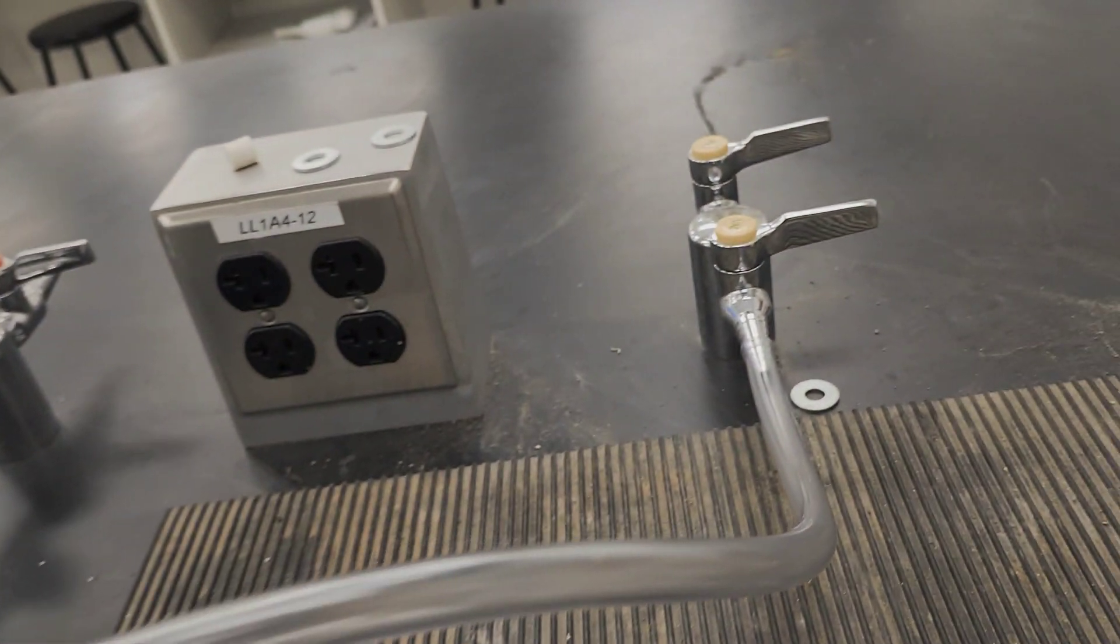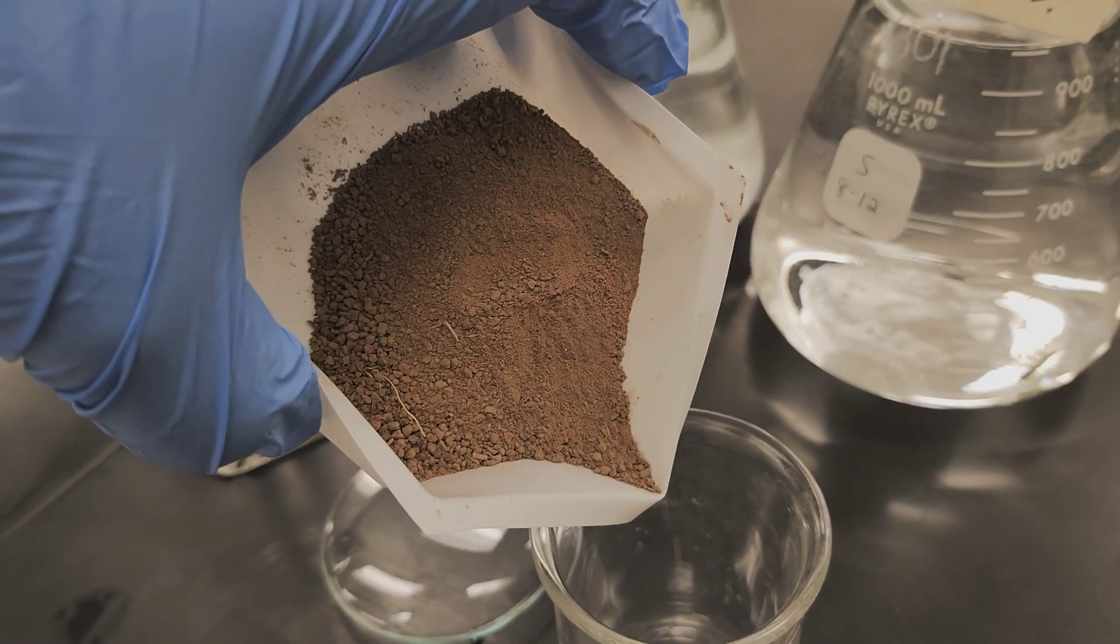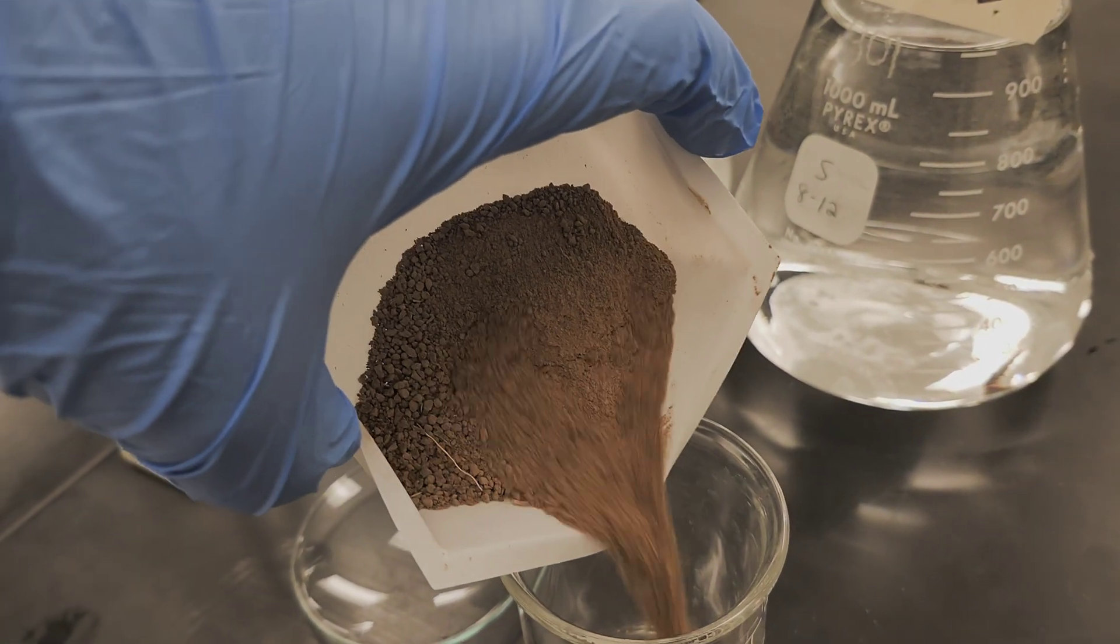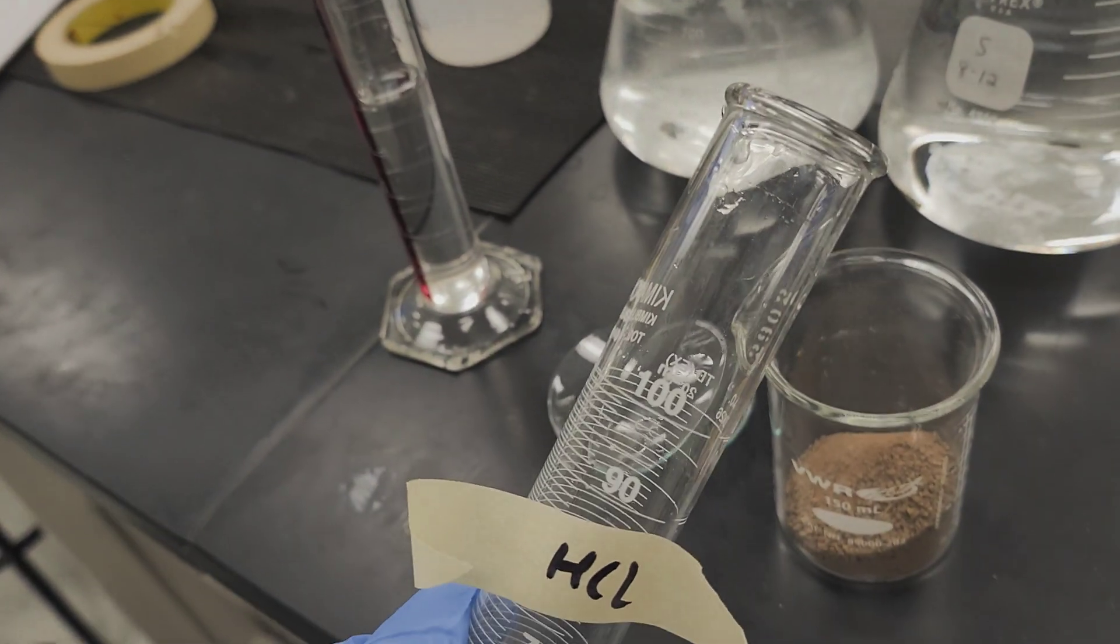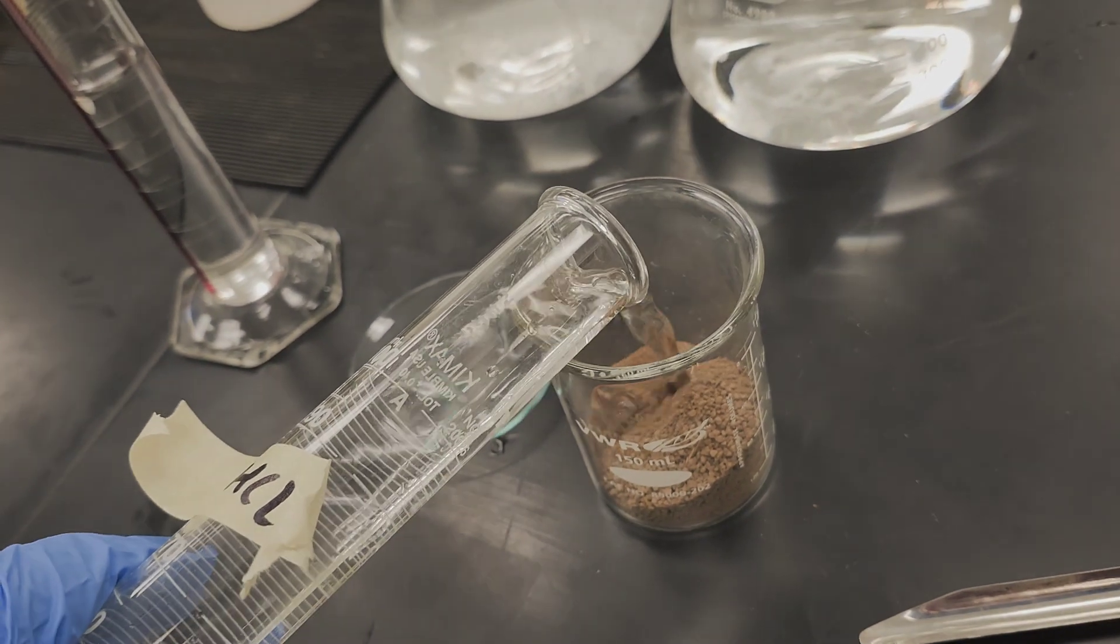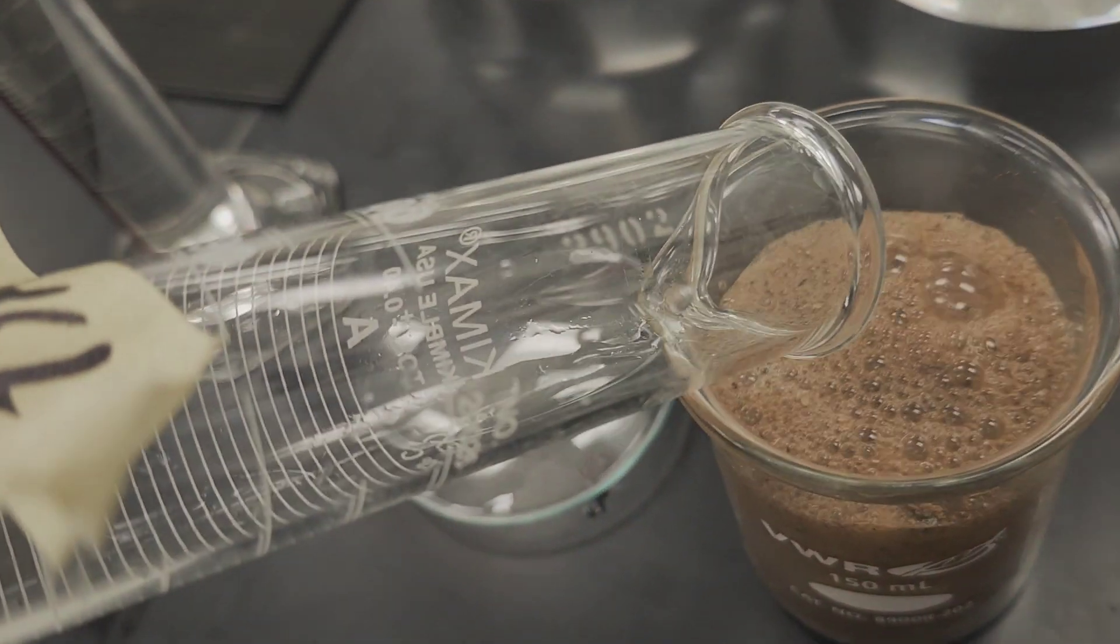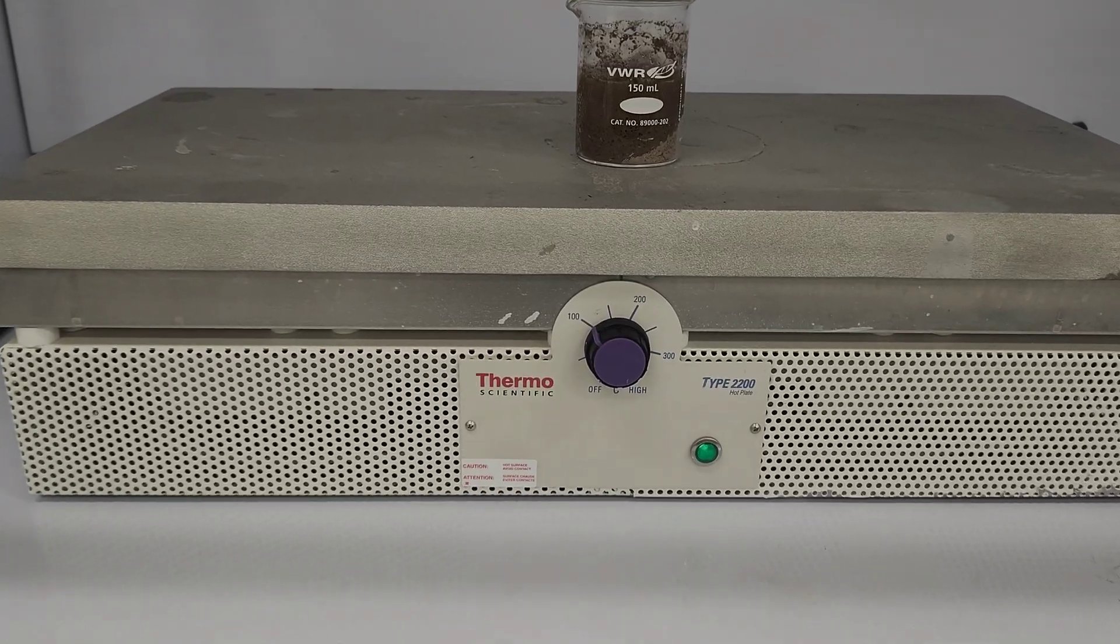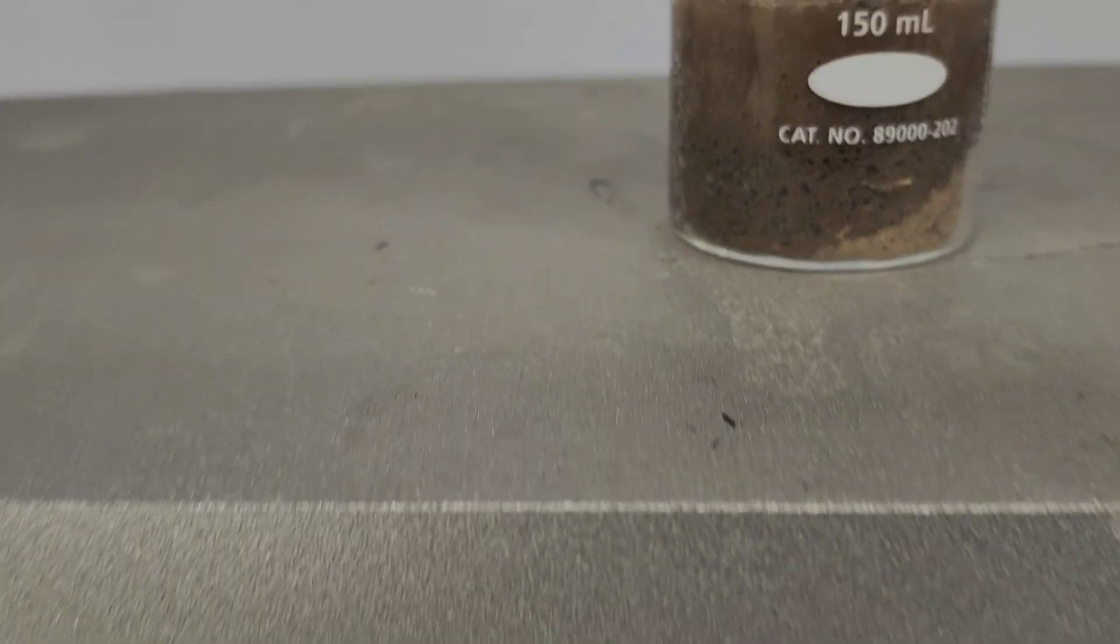First, we need to wet 10 grams of soil, then mix that soil in 50 ml of standardized 0.5 molar hydrochloric solution in a 150 ml beaker. Then we need to boil the soil on the hot plate for at least five minutes.